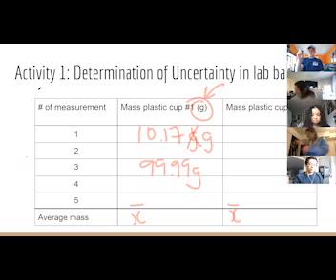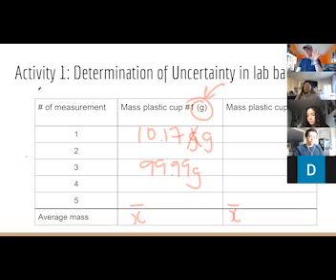If somebody just wrote a very slight 1, or if someone else just ground down and put like a huge 1 on it, yeah, the mass of the wax pen is something that needs to be considered. Excellent. What about your hands? Sweat. Sweat, oil, germs, protein, they're all being transferred from your hands to the cup.